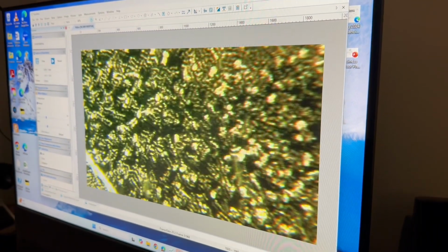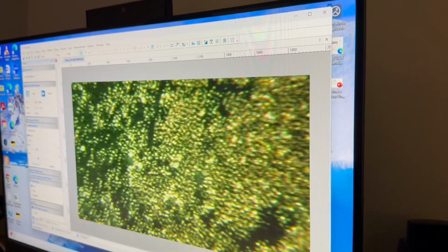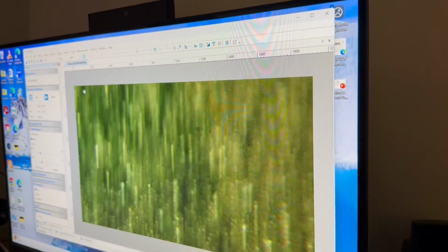Well, I did wipe the slide. Normally I wipe the slide with a blue cloth. I just didn't have it here because the blue cloth would allow me to see a blue thread. Yeah, right. And in that way I can separate it out.